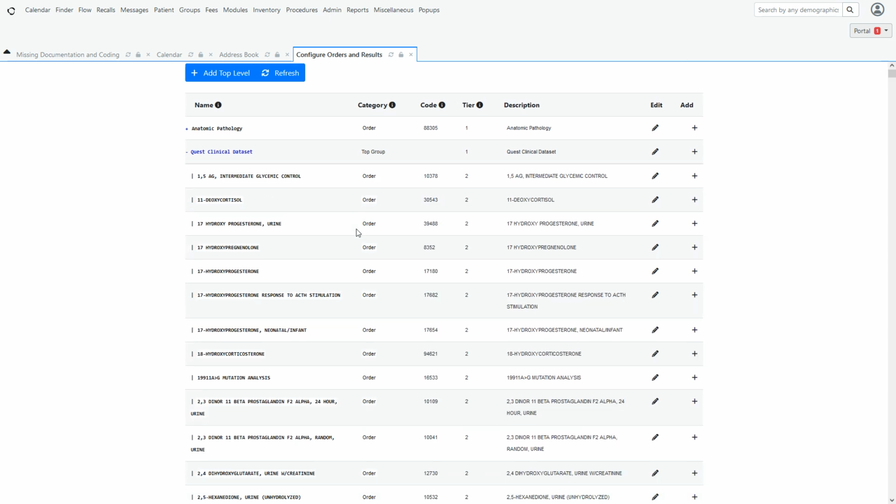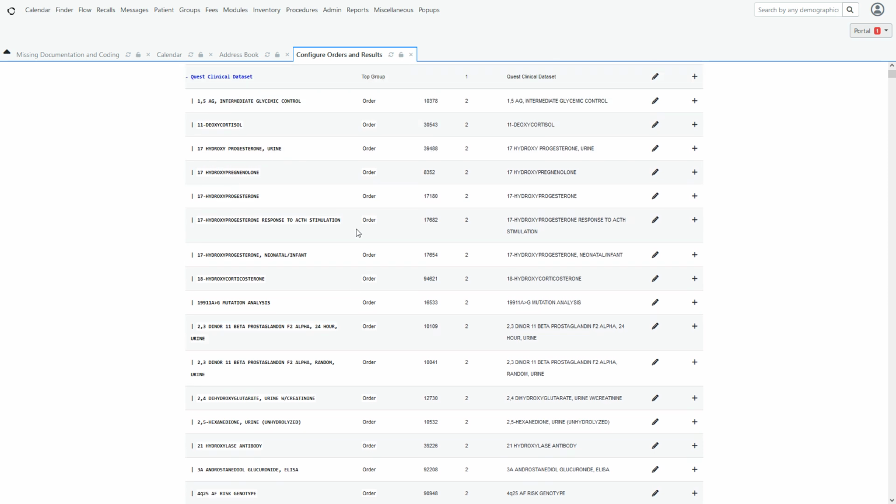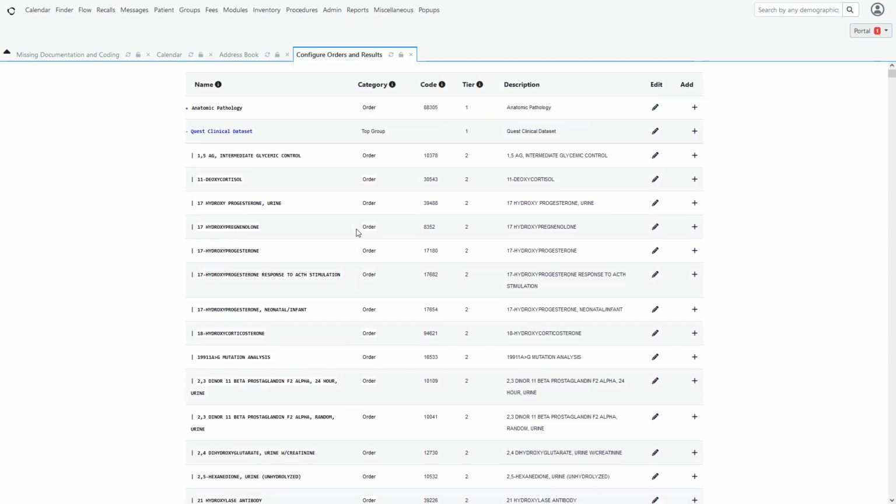All right, and for those who are following us on the community board, we have the Quest module for sending and receiving orders. And what you're going to find here is that we have added that feature. So when we come out of certification this time, there will be a function, and I might as well go ahead and show it to you.